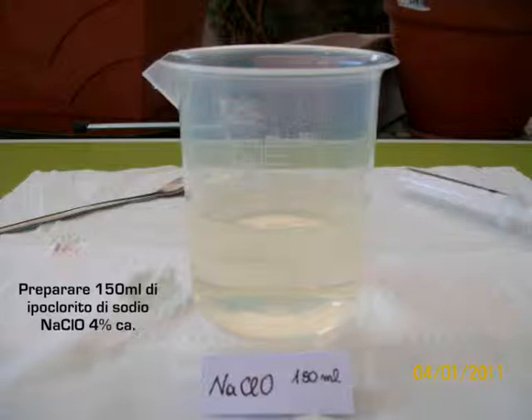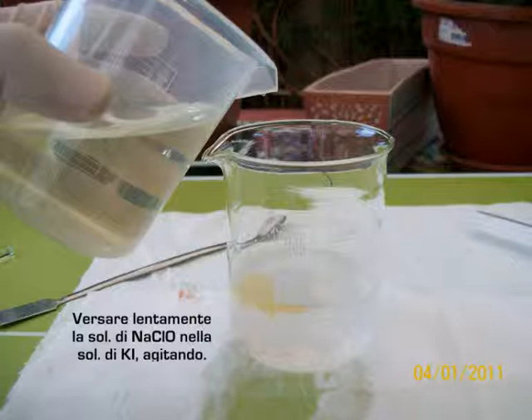Prepare 150 ml of sodium hypochlorite. Pour slowly, while shaking, the solution of sodium hypochlorite into the solution of potassium iodide and dichloromethane.